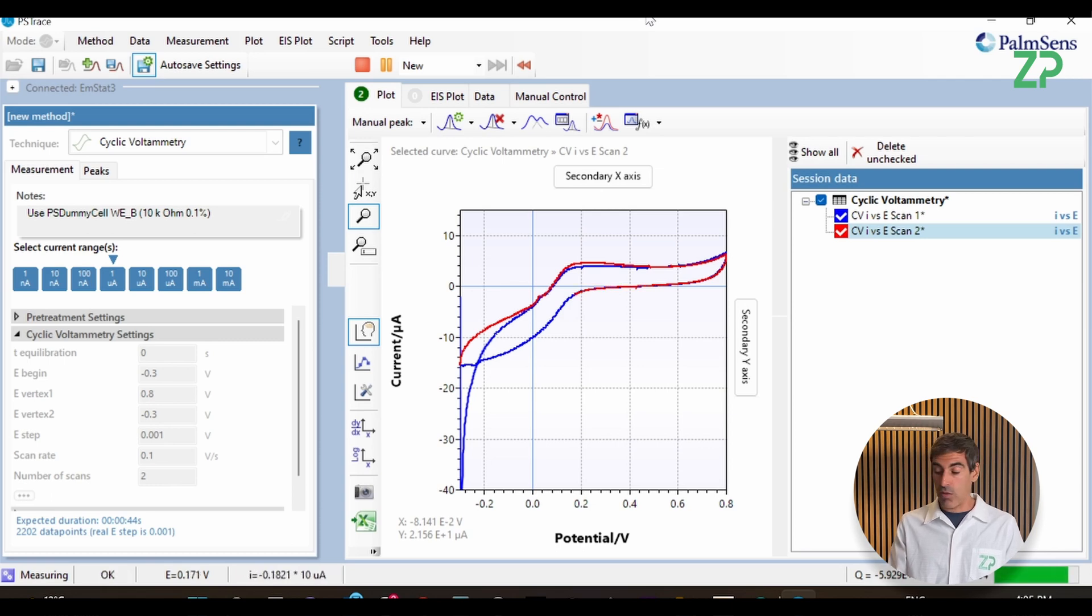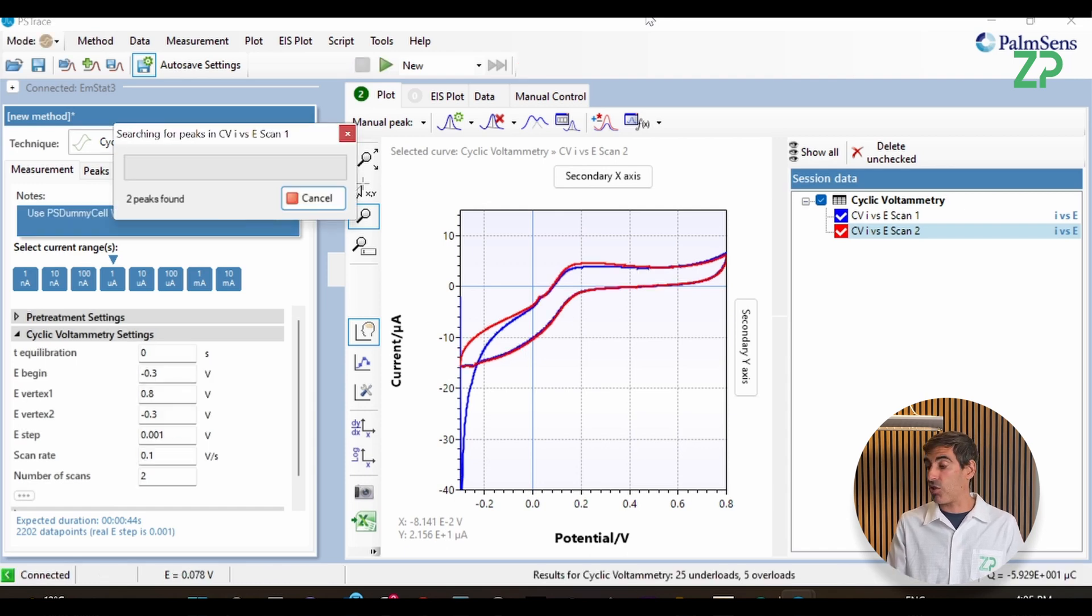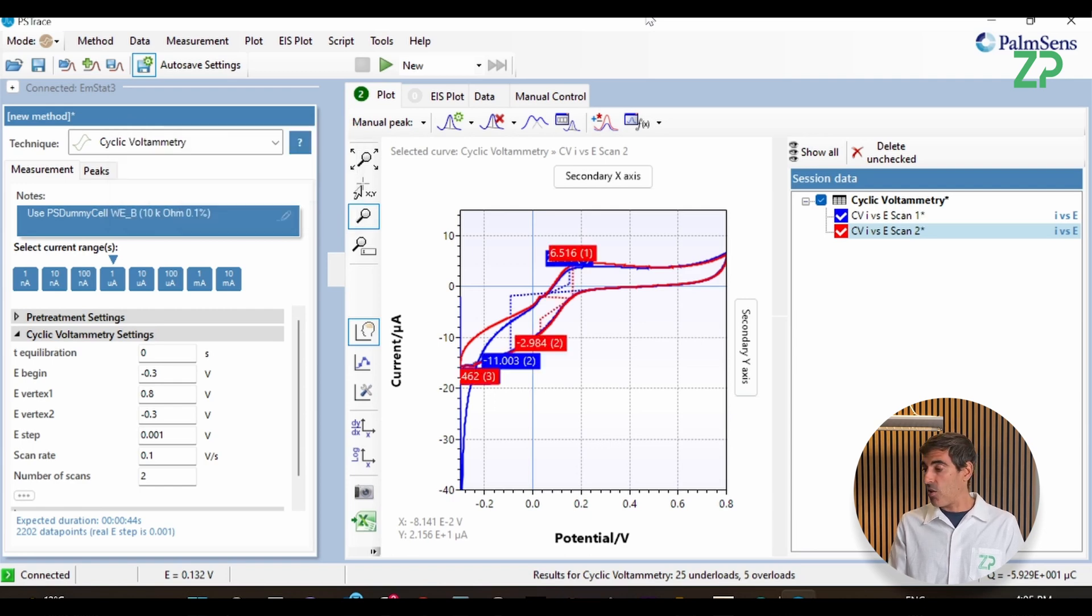Or you could run, for example, if it's a potentiometric sensor, you could run a constant current or no current at all and just measure the open circuit potential. So I think this was a quite successful demo. Here you could literally see the oxidation and a little bit of the reduction peak. So it's a redox reaction.